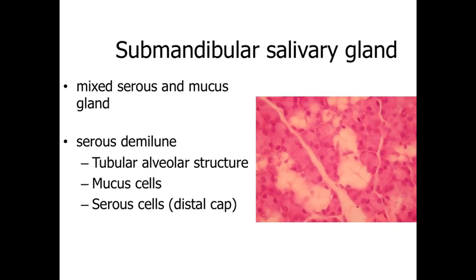The submandibular salivary gland is another example of a mixed serous and mucus gland, with more serous cells than what we'd see in the sublingual salivary gland. We can see good examples of darker staining serous cells and lighter staining mucus cells. What we can often see within the submandibular salivary gland are structures called serous demilunes — at the tip of the tubular alveolar structure, at the base of the test tube where we'd have the secretory region. Mucus-secreting cells are present, and then the serous cells form this demilune, a half-moon-like structure forming a cap at the very base of this test tube-like secretory region.